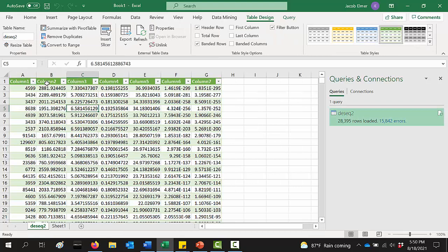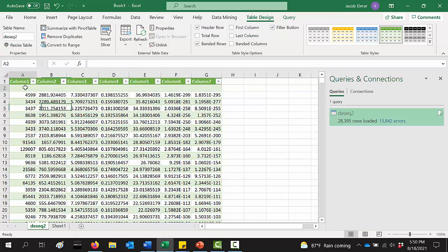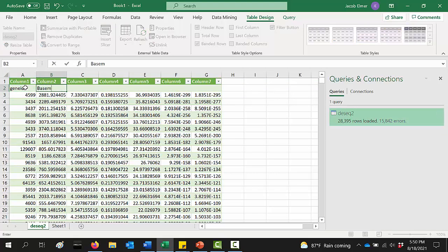And oh, it didn't copy the headers. Well, let's put that info in here. So what this is showing you from left to right is you've got the gene ID over here. I believe it's then the base mean. Then it goes the log2 fold change.